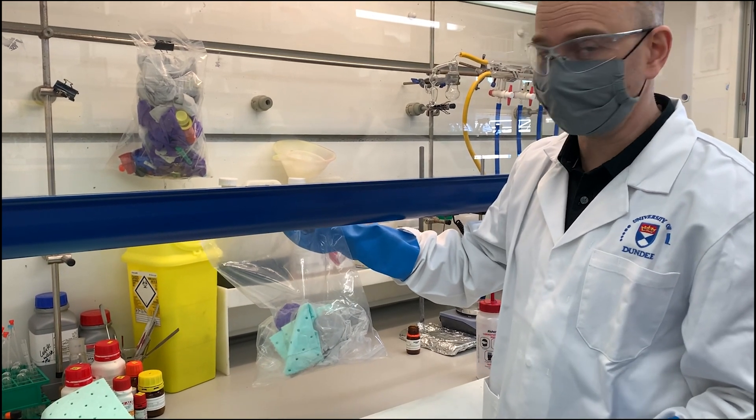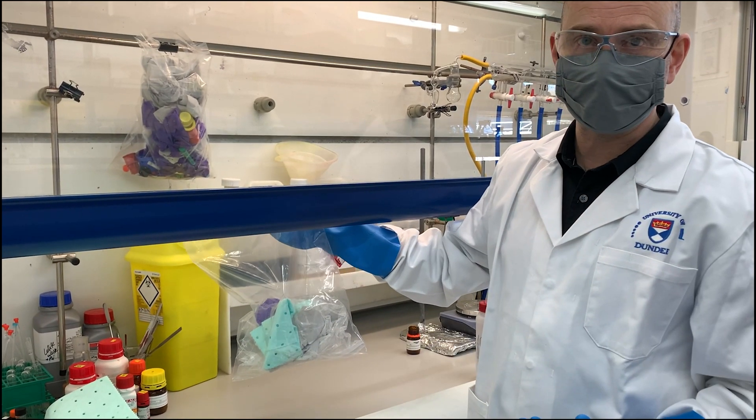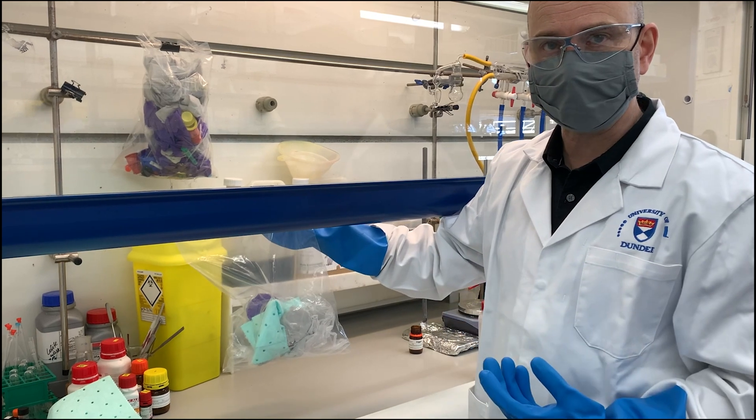It's perfectly safe now, and the outside is essentially free of any contamination because I've used a second pair of gloves.